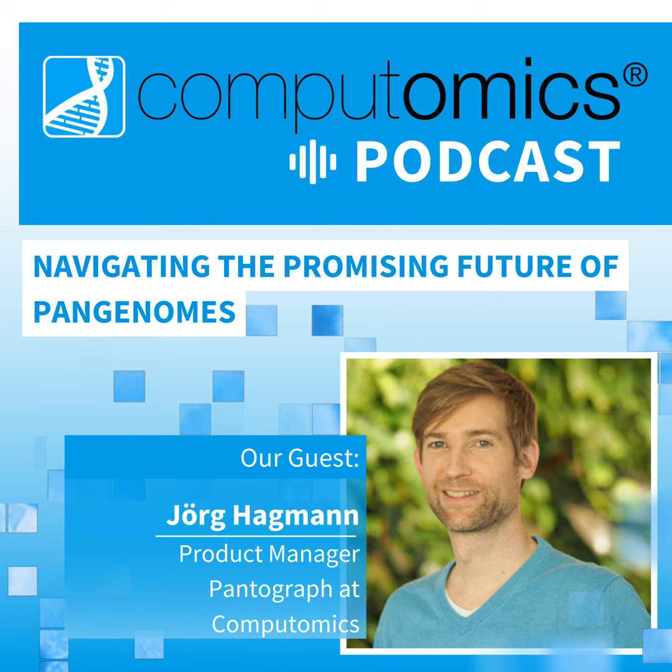And the newest addition is basically that you can also show not only the latest sequencing data, which is whole genome assemblies, pangenomes, but also the traditionally or most commonly used genetic data, namely whole genome sequencing data from next generation sequencing technology, as well as marker data from SNP chips, for example, which is a very cost-efficient way of finding out the genetic makeup of individuals.